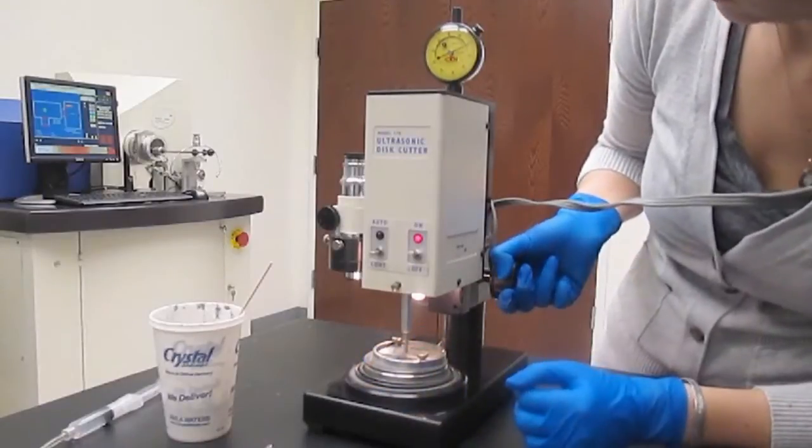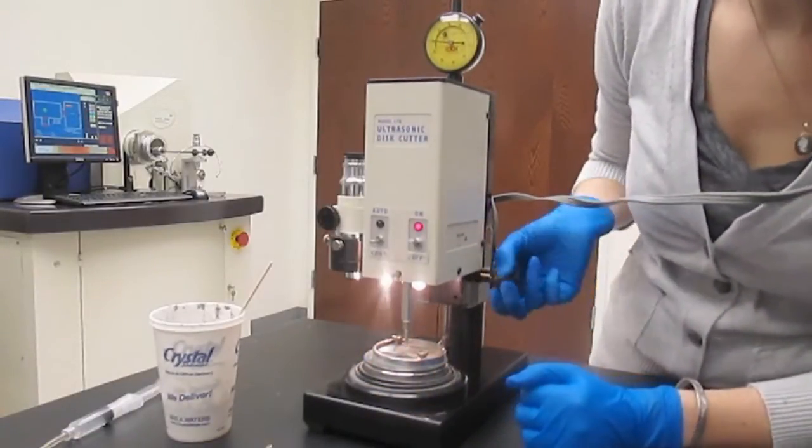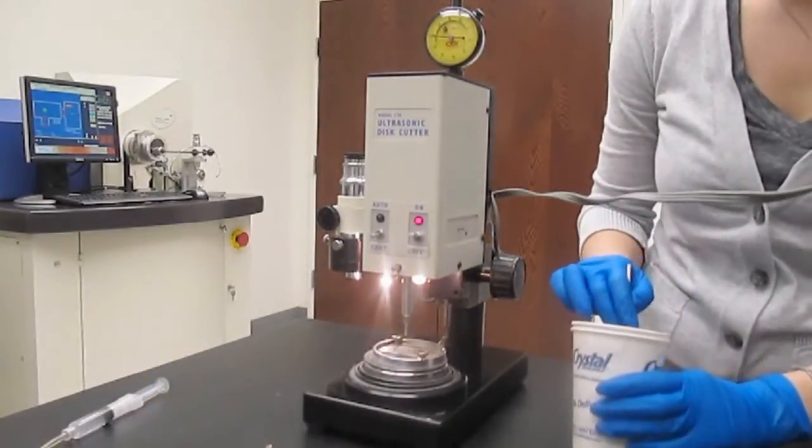If the dial indicator needle moves, that means that the indicator connecting rod is making contact with the indicator contactor assembly. Raise the cutting tool from the surface of the glass.